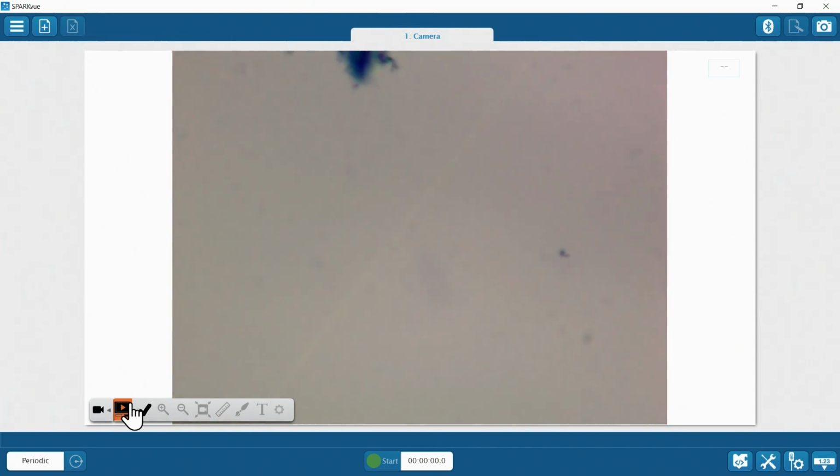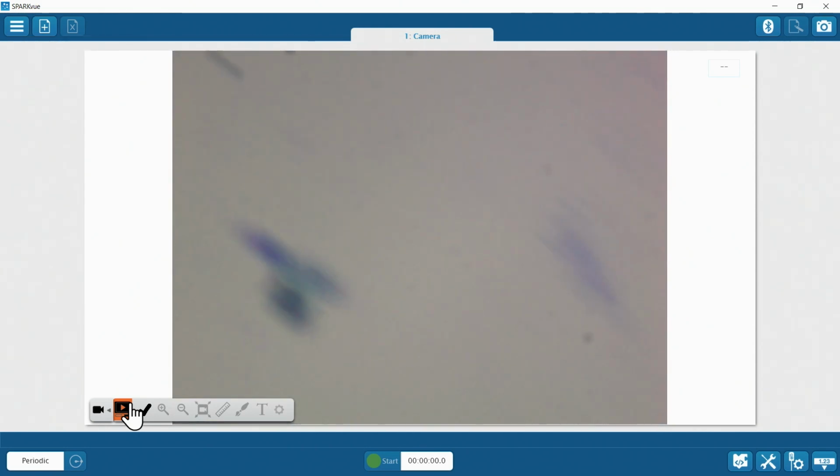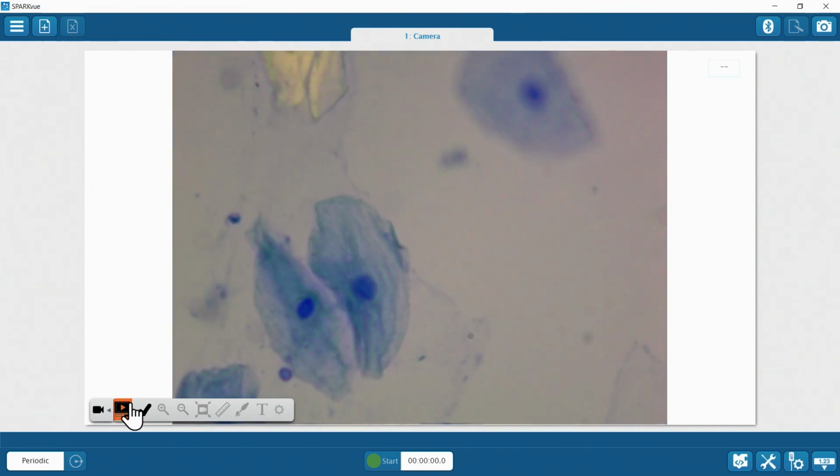All right. And I am going to take a snapshot in a moment. Let's just go back to where we were a second ago. Or no, in fact, let's find new ones.